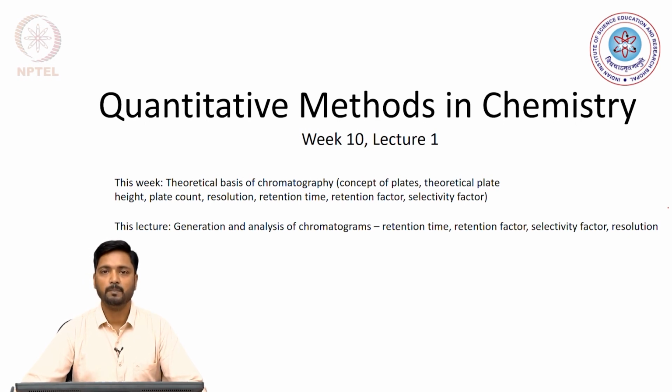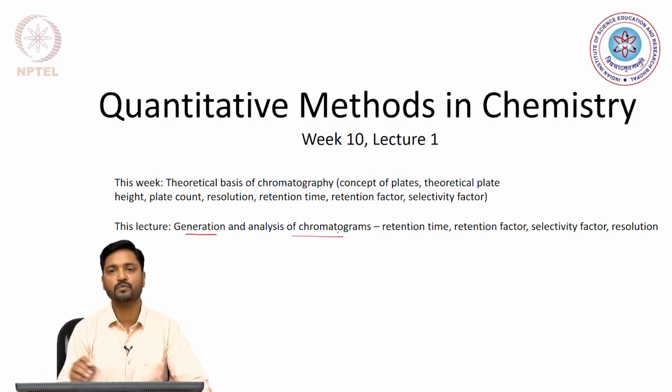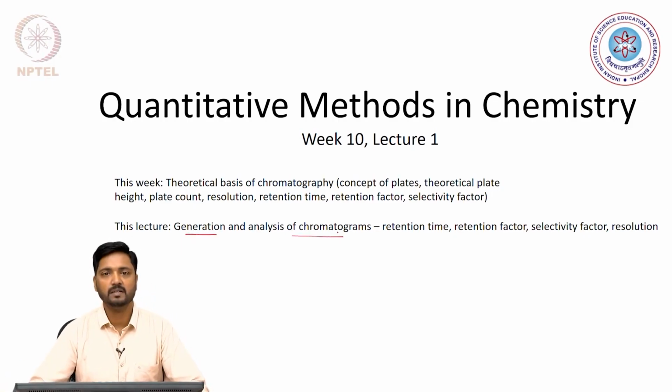So, this part of the lecture will focus on the generation and analysis of chromatograms, and we will get an understanding of what we imply by retention time, retention factor, selectivity factor and resolution of the peaks. So, let us get started with this lecture.